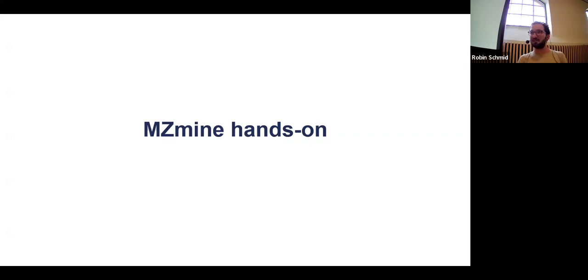So try out MSDial, try out MZmine, and compare what you get, right? It's very hard to tell which one is the best tool, but traditionally, they had a very strong focus on that. So I think their methods work very nicely, especially for all the Waters data that very often is acquired in data independent acquisition. They might have really specialized on that.